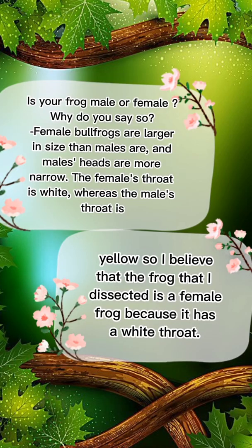Is your frog male or female? Why do you say so? Female bullfrogs are larger in size than males, and males' heads are narrower. The female's throat is white, whereas the male's throat is yellow. So I believe that the frog that I dissected is a female frog because it has a white throat.